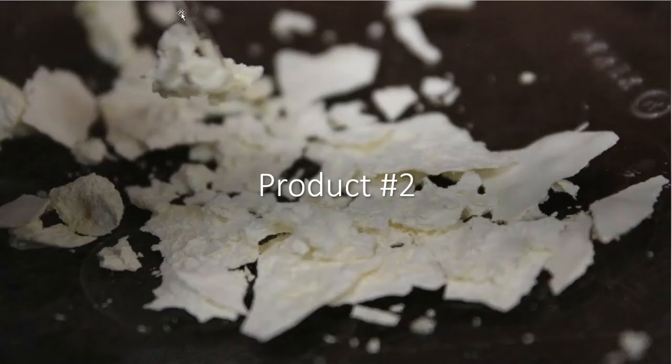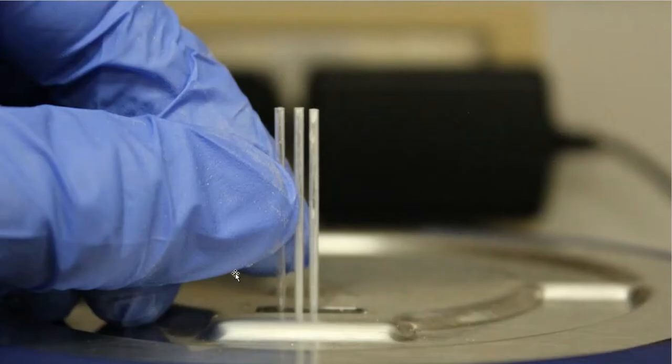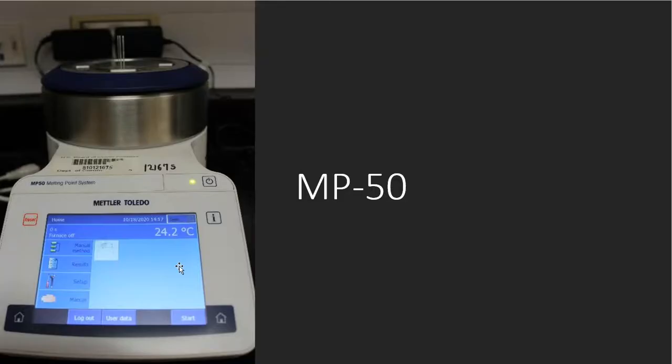There's my capillary in the back here. And I'm just going to crunch until I get enough crystal in the capillary tubes. And then I do the same for product number 3. Again, crunch. This was more powdery. It was very easy to load this one into the capillary tubes compared to the other two. And then those three capillaries are going to go down into my melting point system. And my melting point is right there.